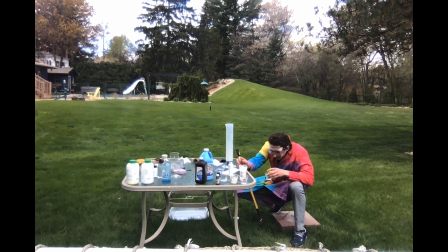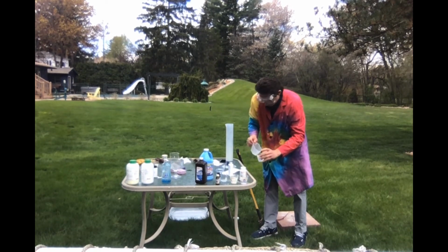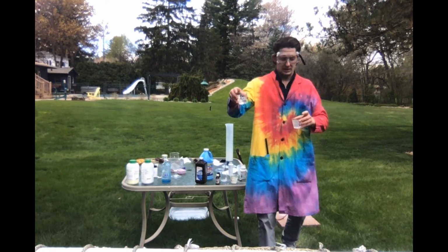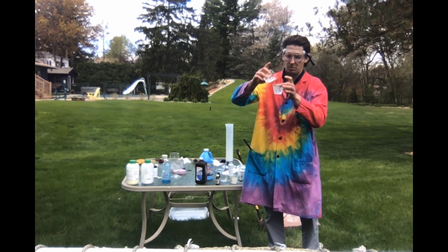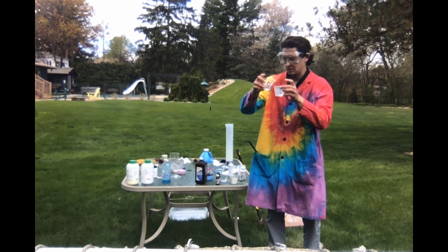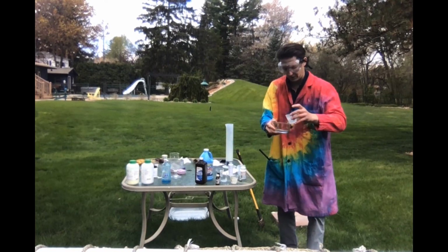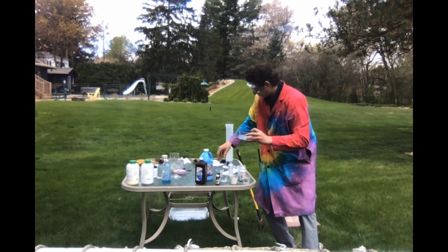I'm getting pretty good at this measuring thing. What I'm going to do is pour our B solution that has A and B in it into here. Let's see if I can use a bigger cup. Should have planned for that. So this is basically C solution. I'm going to pour B right here.